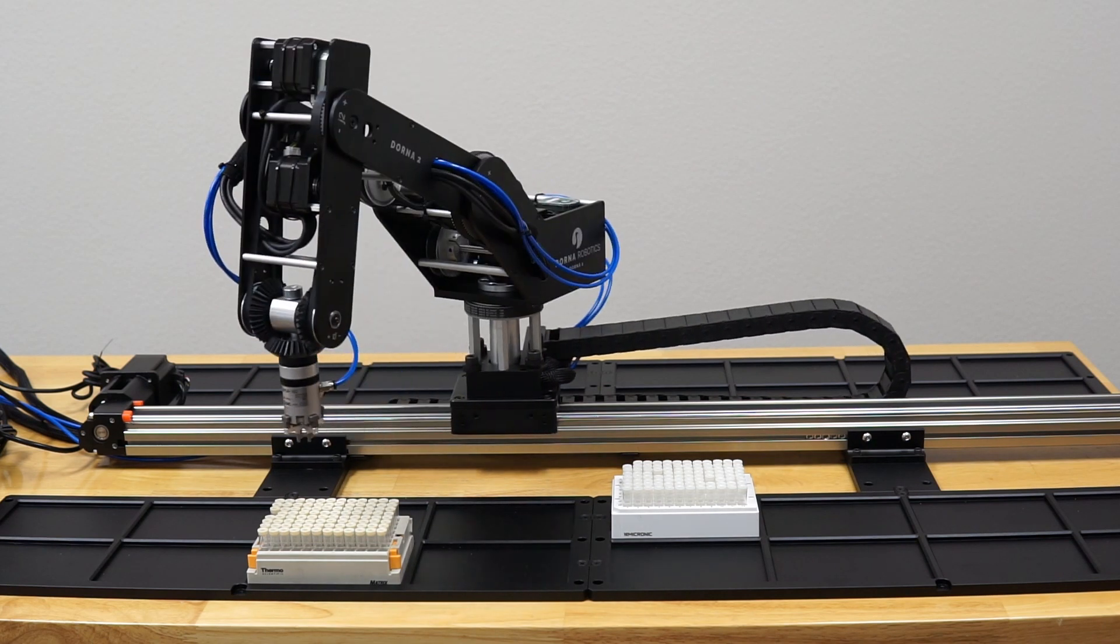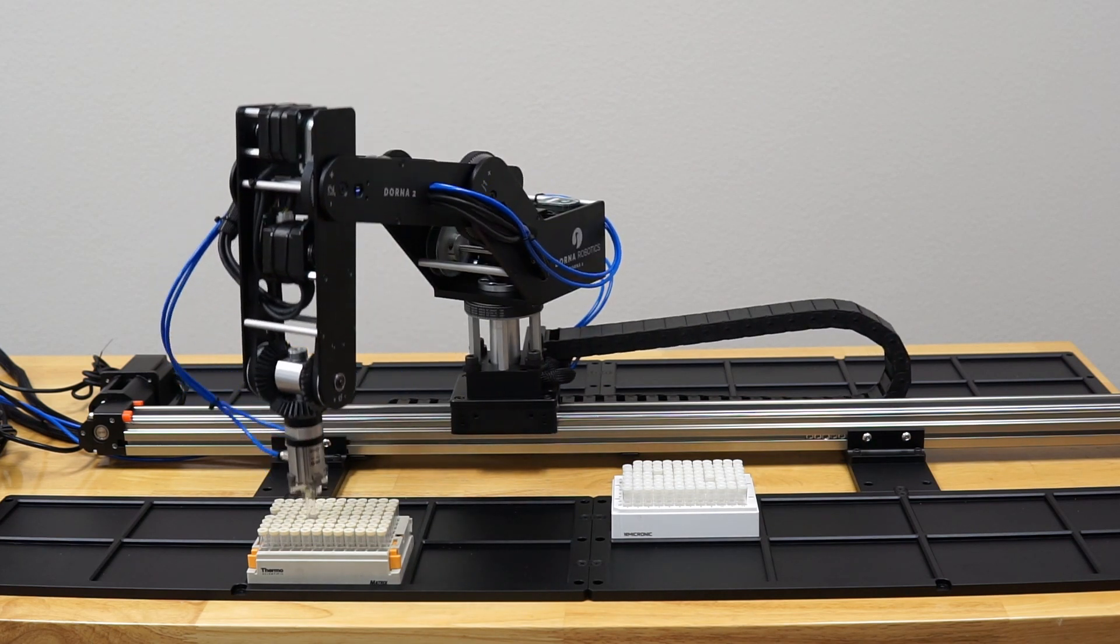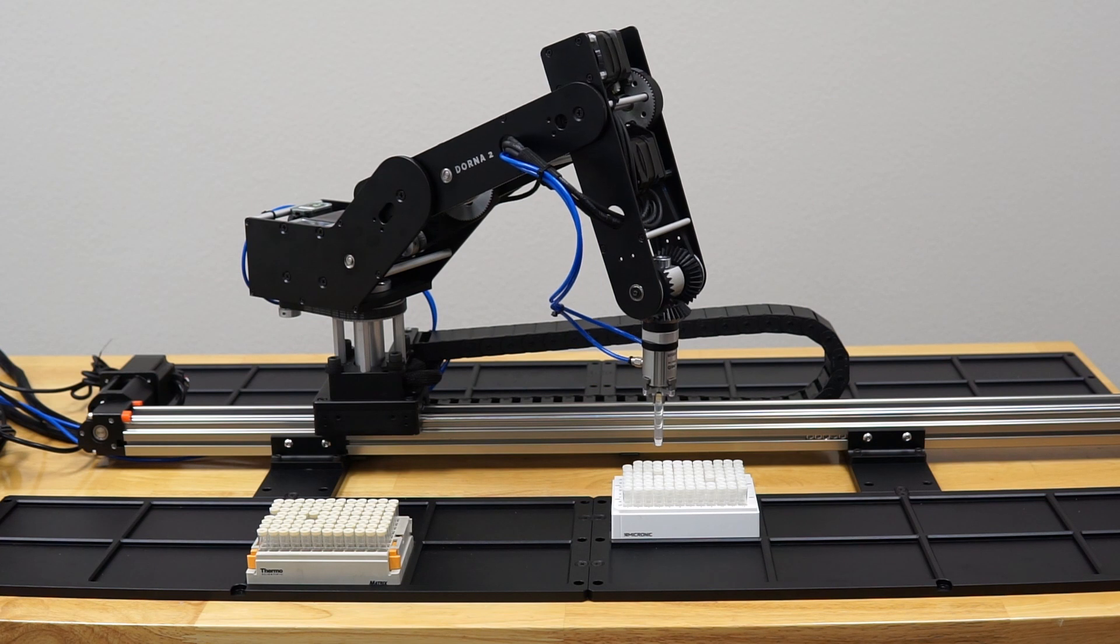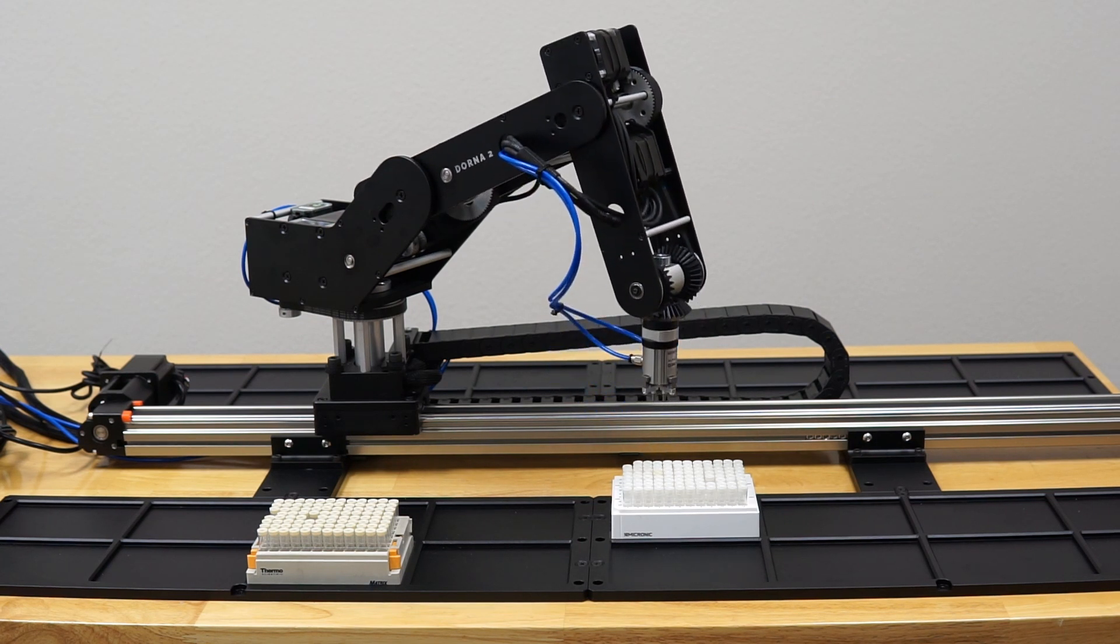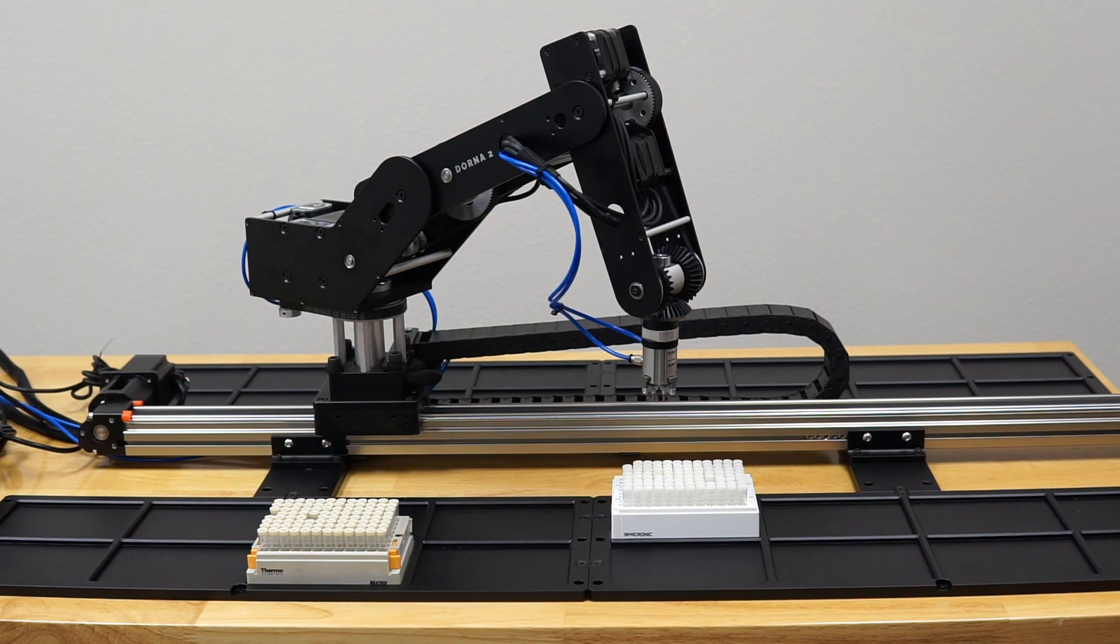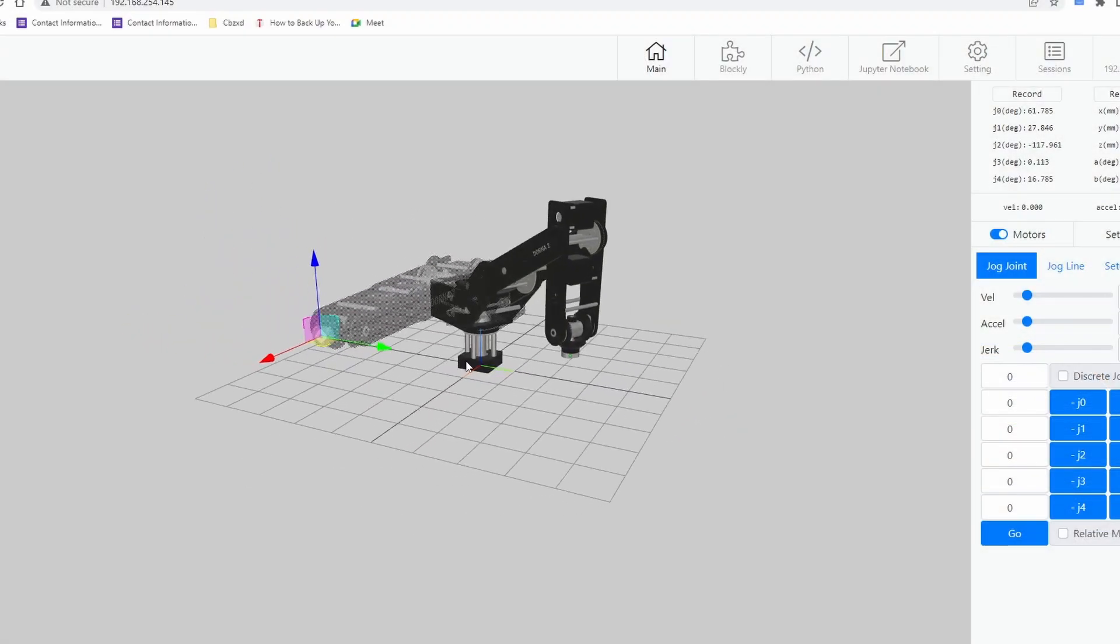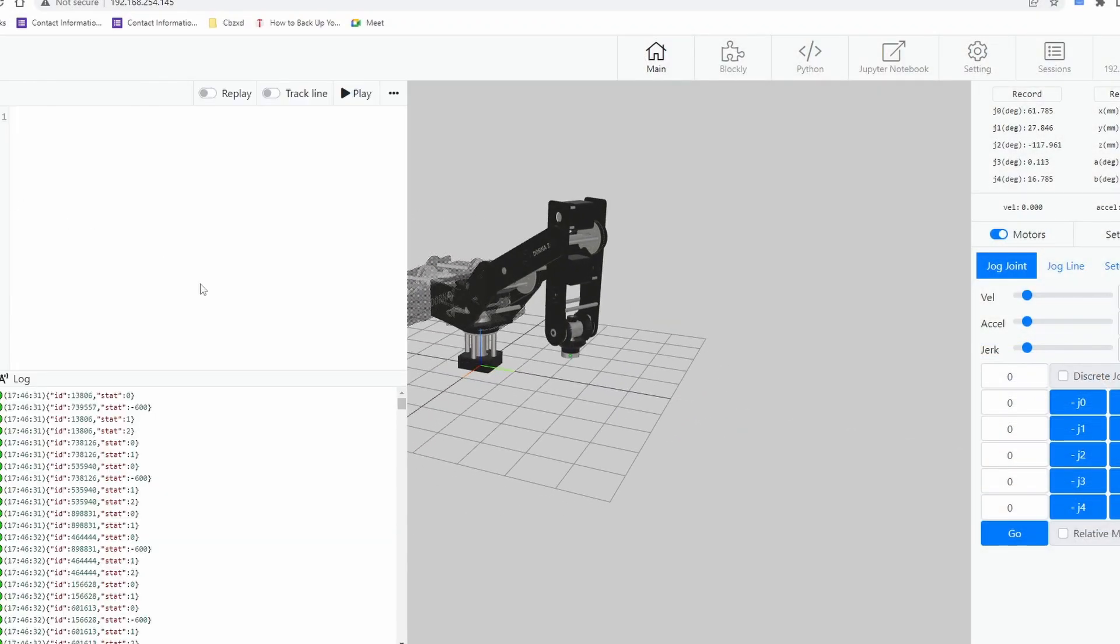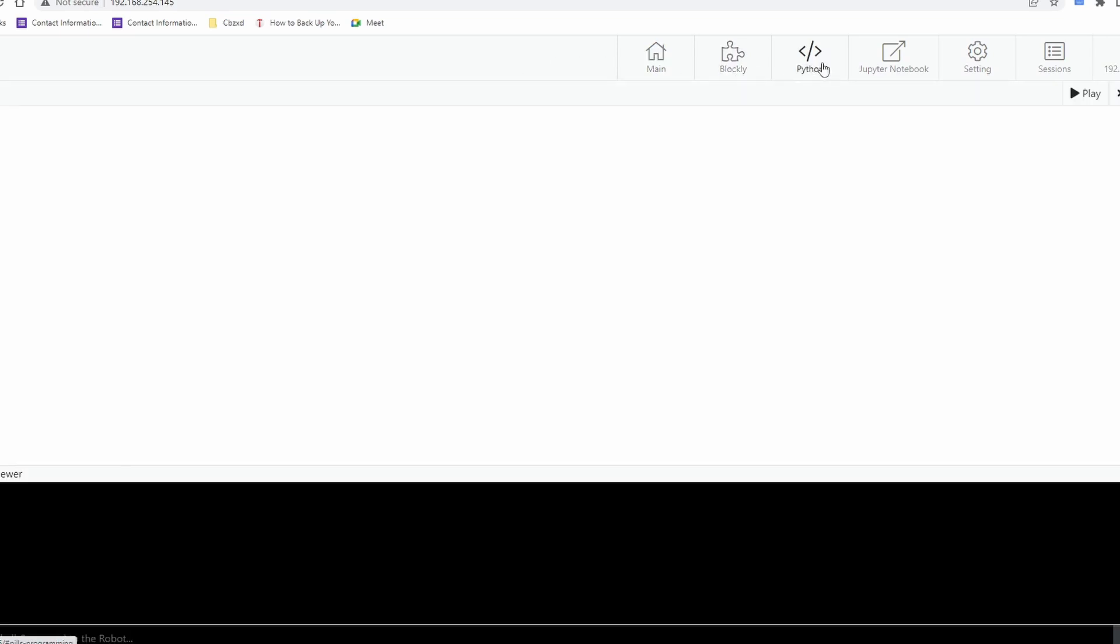The goal is for the user to specify the location of the microtube that needs to be picked and the final location of the microtube. We will demonstrate how to plan the moves between two microplates but it's easy to extend the logic to all 16 microplates. For programming the robot we have multiple options. Using the robot commands in the scripting window, using blockly or using python. Here we are going to use python because it is more flexible and gives the option for the program to get the user input for the pick and place locations.